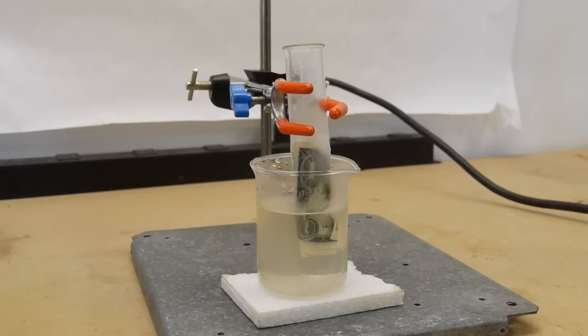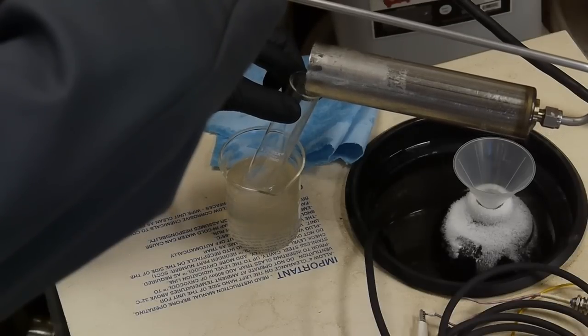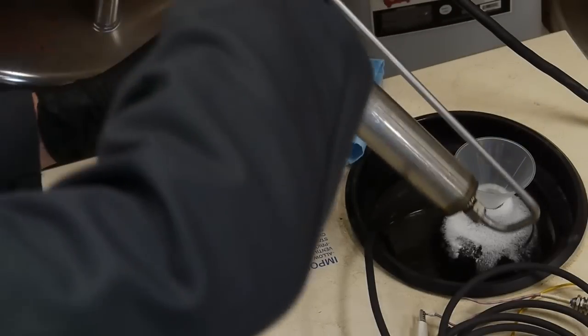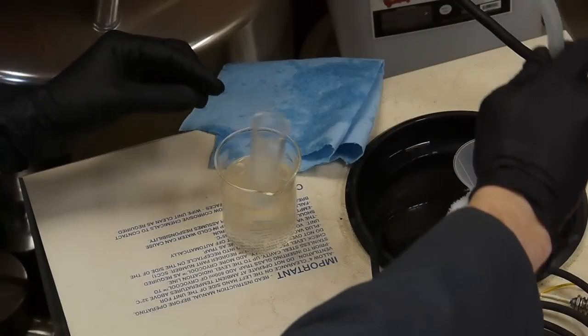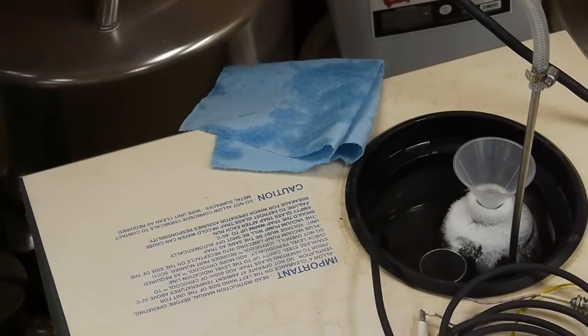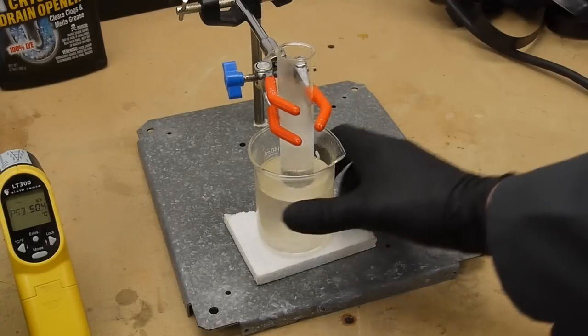The liquid ammonia is very cold at atmospheric pressure. In my previous video when I was creating this liquid ammonia, I had it stored in a cryogenic freezer. I poured a little bit out into a test tube and then kept the test tube in a beaker full of cold alcohol just to keep the ammonia from boiling as quickly.